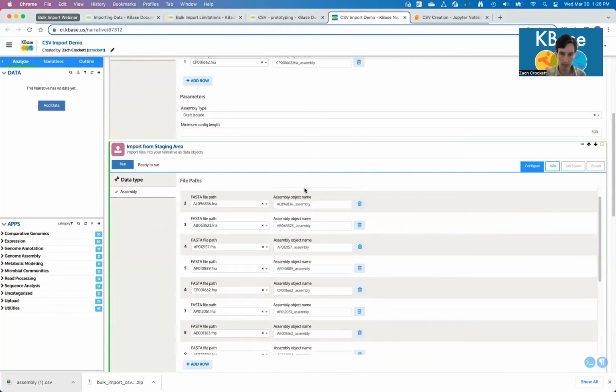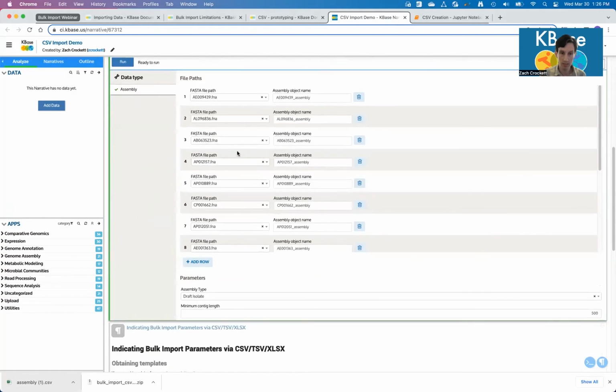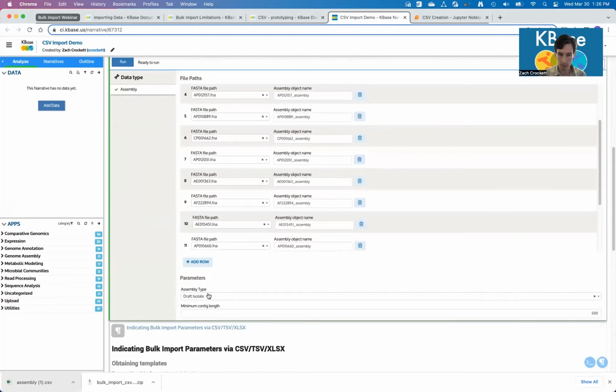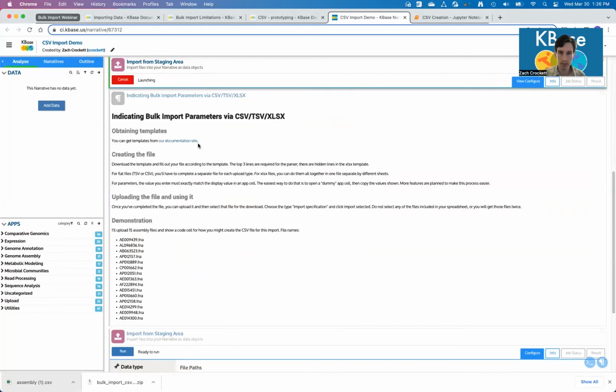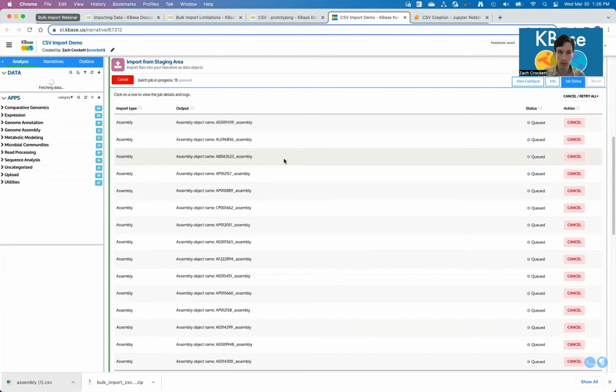It took a second, but it read it, and then it imported this, and then it set up the cell with all of the files that I selected and all the parameters. From this point on, it is the same as the regular bulk upload. Once you run it, it will have the same job status tab and results tab when it's complete.